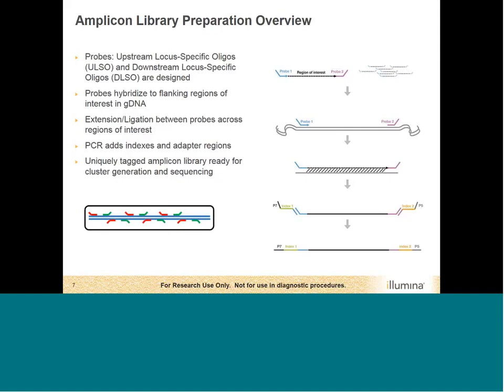There might be situations where you are interested in sequencing both the plus and the minus strand. And this can be really important if you have FFPE samples. The FFPE process itself can yield artifacts through deamination or other events that can cause single nucleotides to change. And so we can distinguish these from true variants by doing a dual pool design, which some of our kits offer.